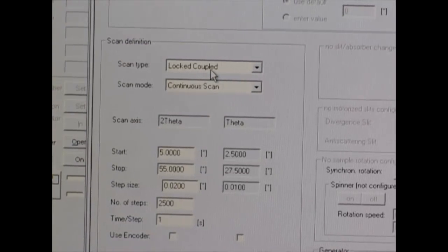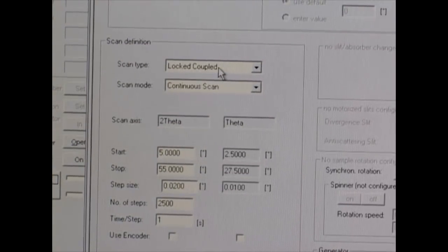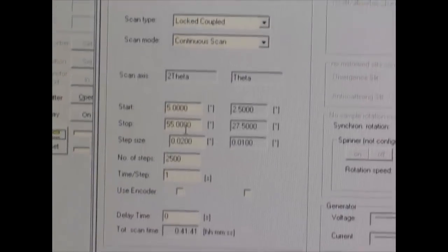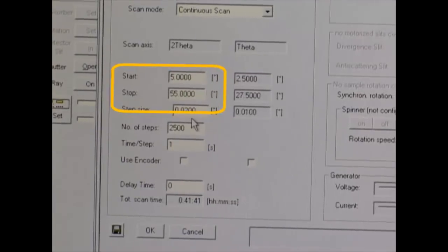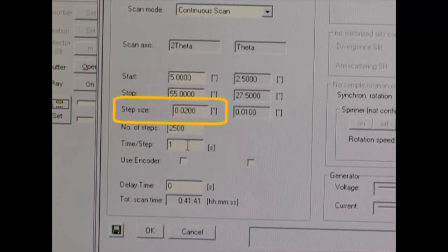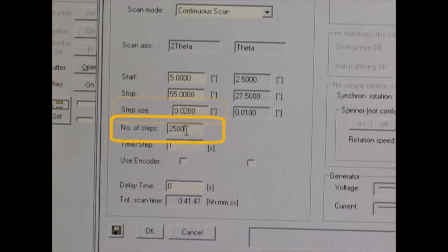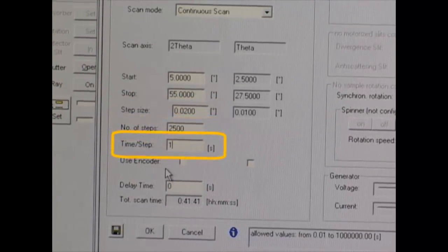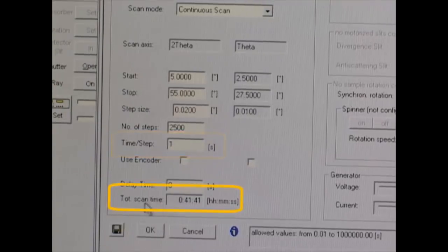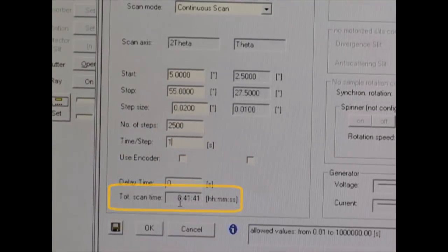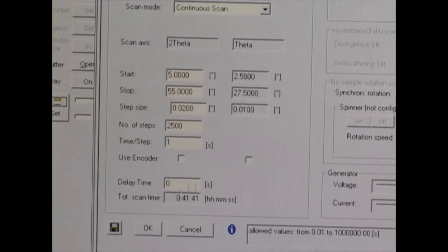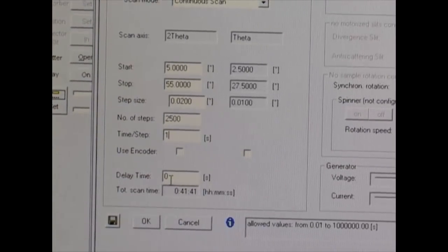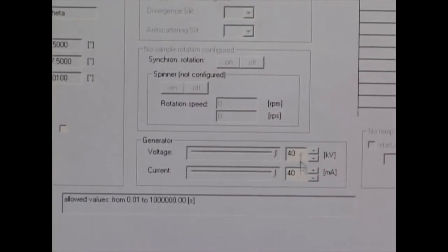Your scan type is locked coupled and continuous. This is the standard way to do it. What this means is that your detector will be following at 2 theta from your sample. You put in your start value and your stop value in 2 theta. Your step size is also in 2 theta. It calculates the number of steps. You put in your time and it will calculate the total scan time. This is important because you want to know how long your scan is going to take and that's an important thing to know when you're reserving your time for the instrument. Also, you can see that generator voltage and current, the default is 40 and 40, which is the maximum.